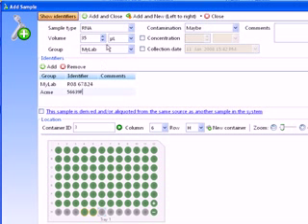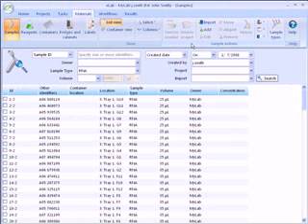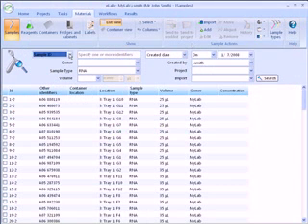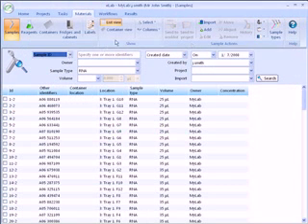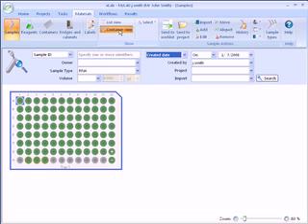We can also view our search results in container view. Note, the three samples we just created appear here.